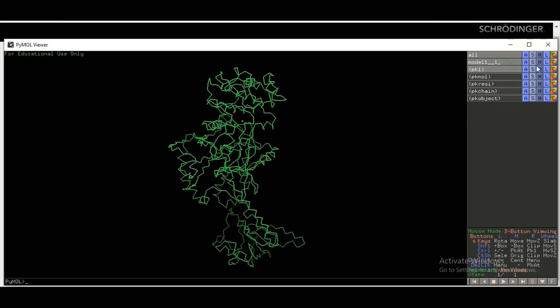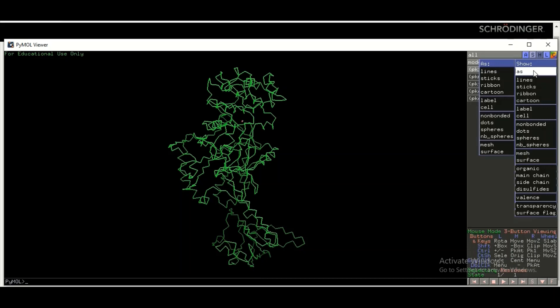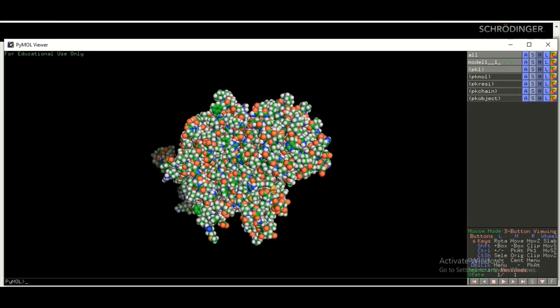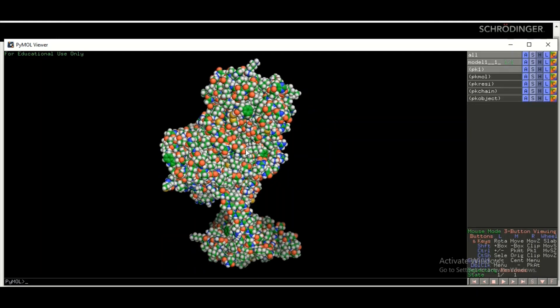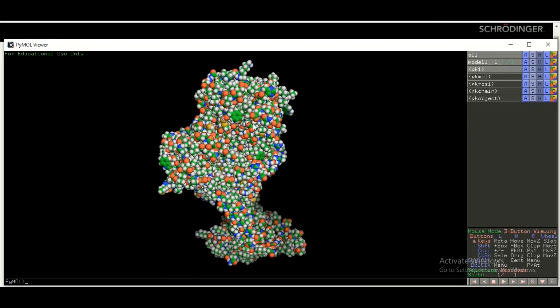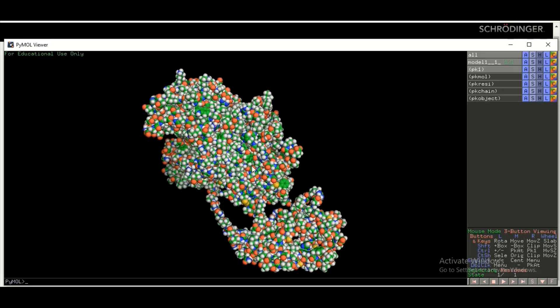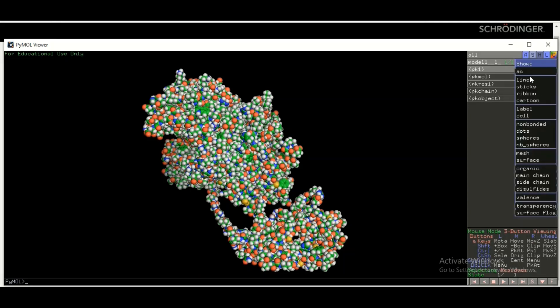If you want to visualize the three-dimensional structure in a sphere form, click on Show once again and select Spheres. In this sphere form, each atom is represented as a ball, and the size of the ball reflects its van der Waals radius.